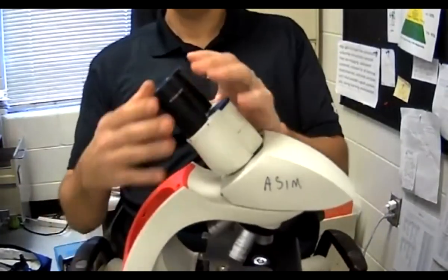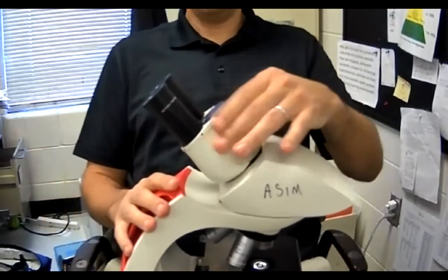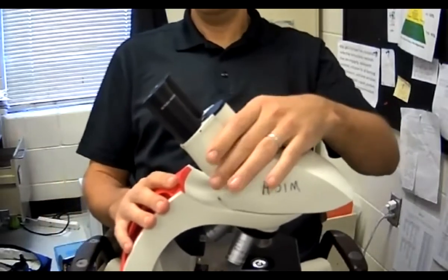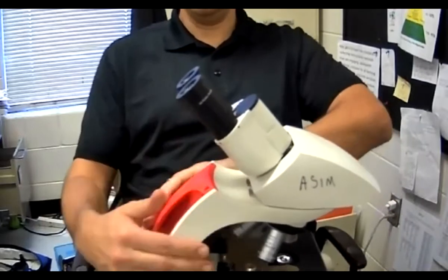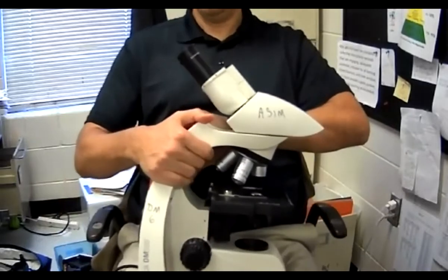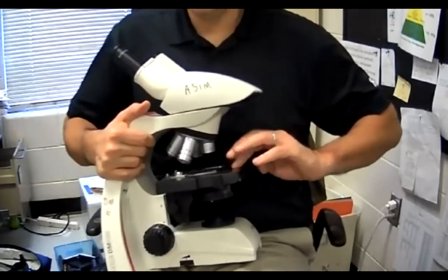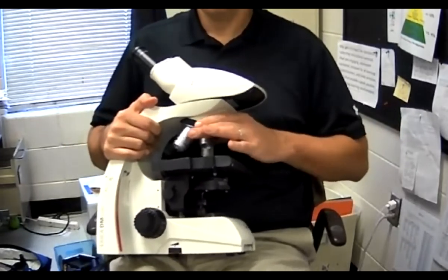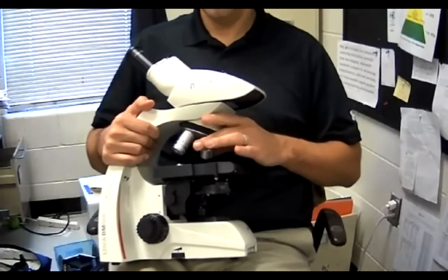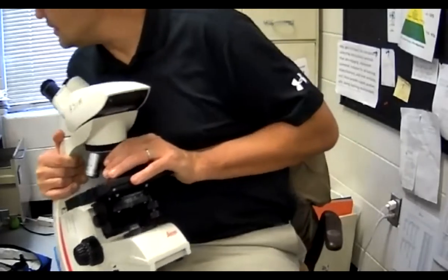Let's review all of them. This is the eyepiece or the oculars. This right here is the body tube. This part right here is the arm. This black area right here is the stage. These right here are the objective lenses.